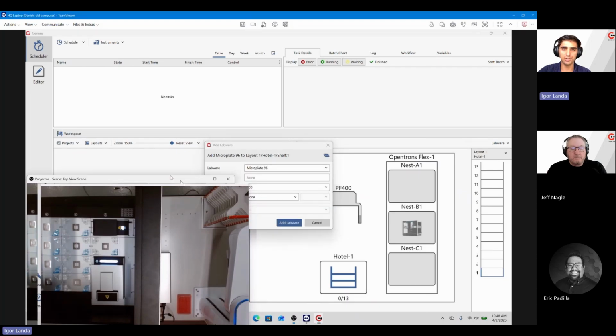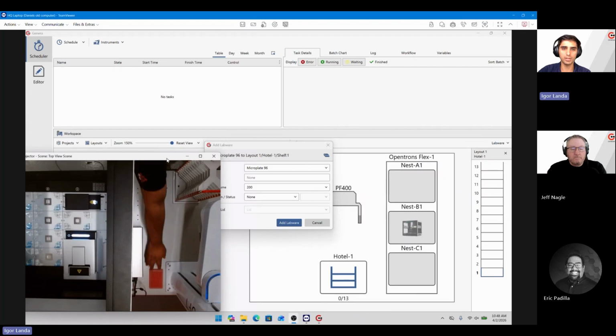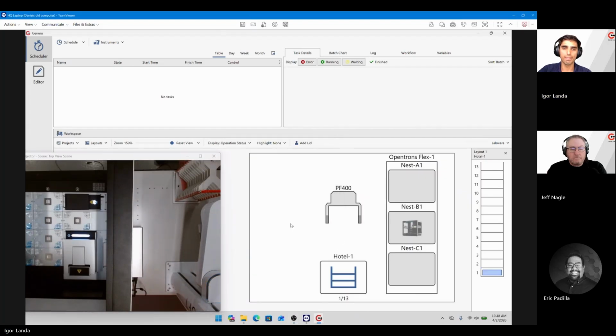And then if Eric, you could put a plate on shelf 1 of the hotel. The big test. Please. Thumbs up, thumbs sideways.